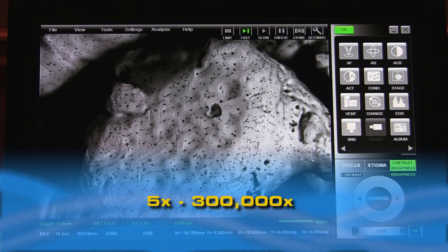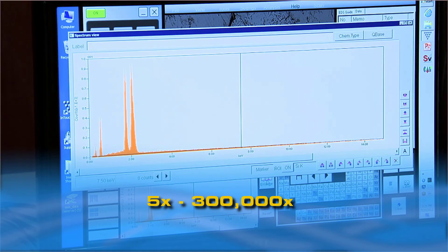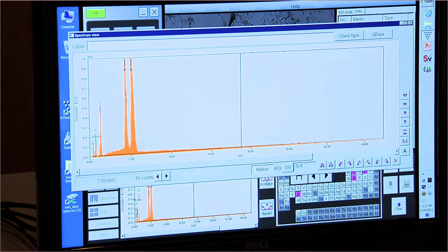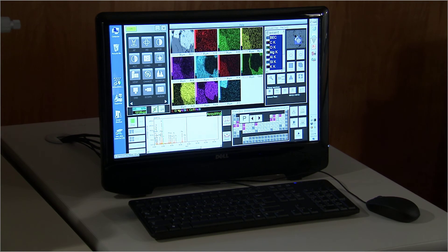InTouchScope features high-resolution imaging with multiple detectors, integrated EDS for elemental analysis, and high and low vacuum operation.